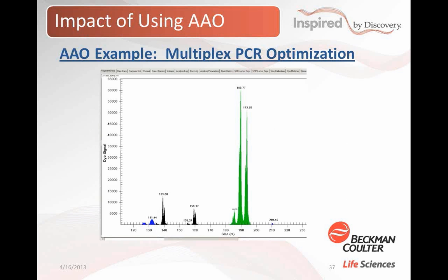So here's a before picture that shows the results prior to optimization. The signal that is seen below about 135 is noise, so ignore the 131 peak. The peaks they were looking for are in the 139 to 159 region, the 189 to 193 region, and then again at the 210 area. Notice that that's a very, very small peak. The signal's very weak, but the software did call that out correctly. So it's good that it found it, but they wanted things to be much more robust.